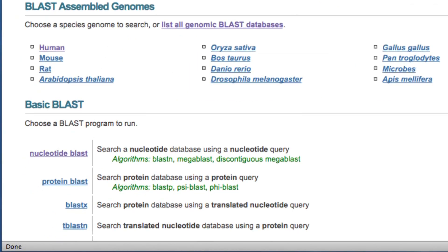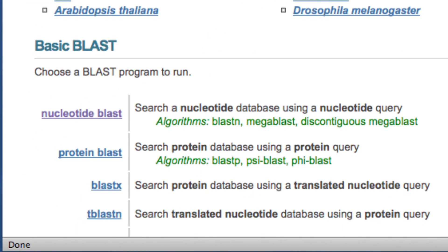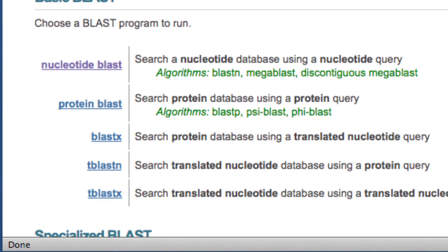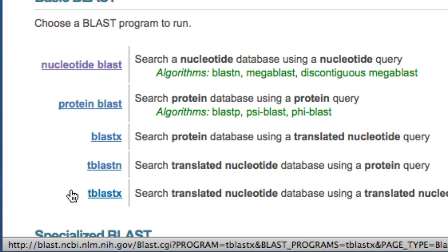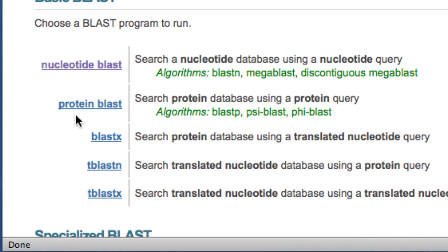There are five BLAST programs. There is nucleotide BLAST, protein BLAST, and then there are three translated BLAST searches, which are a little bit more advanced. In general, if you're starting with a DNA sequence, you would want to use nucleotide BLAST. If you're starting with a protein sequence, you would want to use protein BLAST.